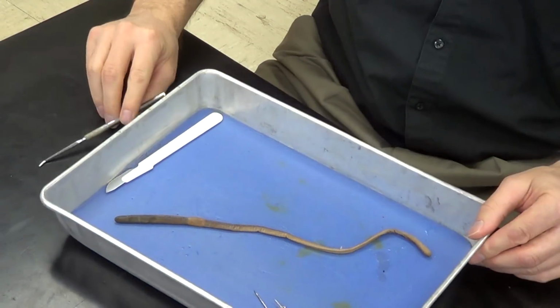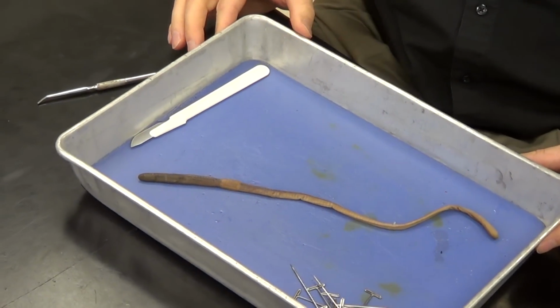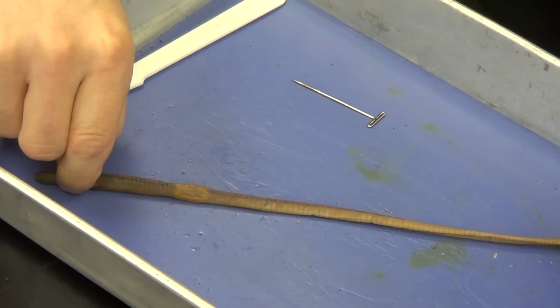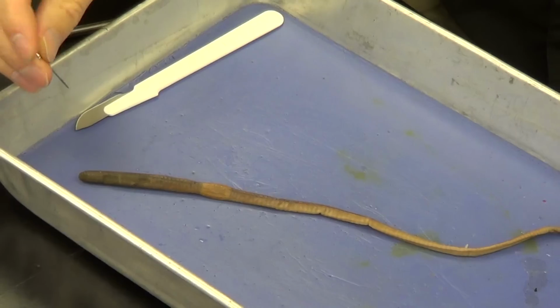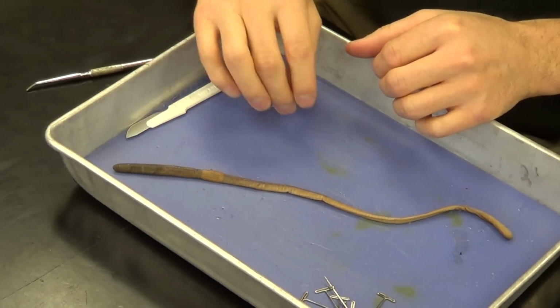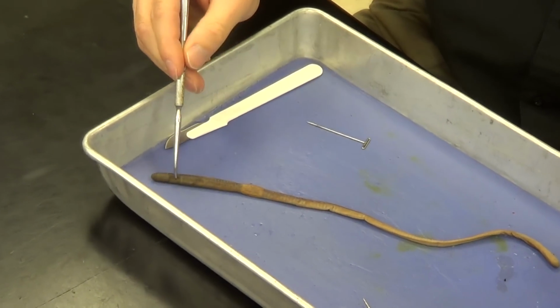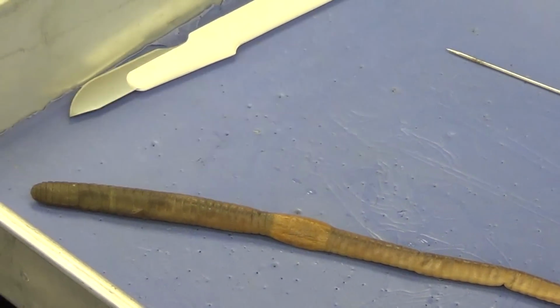So we have our earthworm in the dissecting tray, and these are fairly large earthworms. So what I would like you to do is to pin the earthworm diagonally across the dissecting tray. And we're going to take 2 pins, and I'm going to take the one pin and put it in the anterior aspect. Now, the anterior aspect is going to be the larger part of the worm. This is the head portion of the earthworm, where all the organs are going to be located.